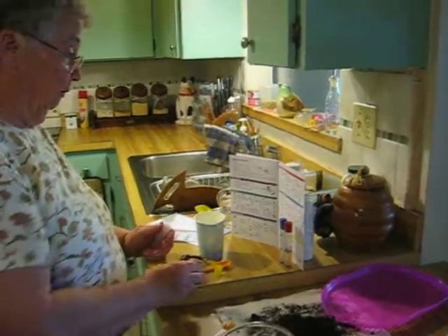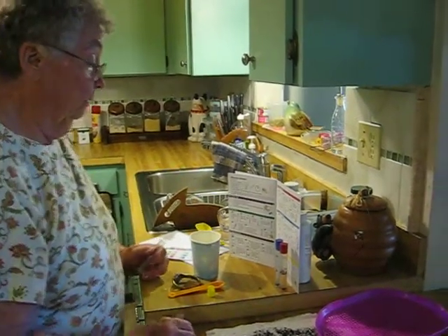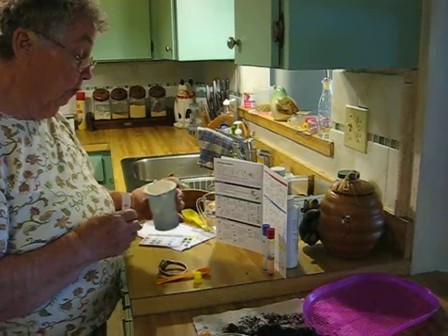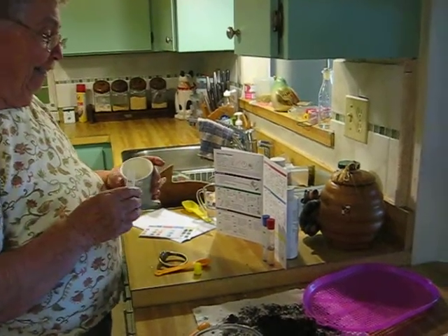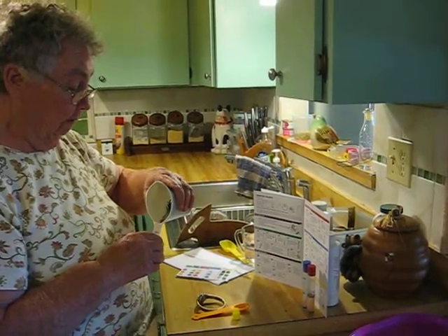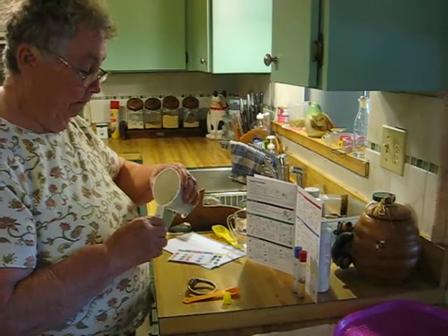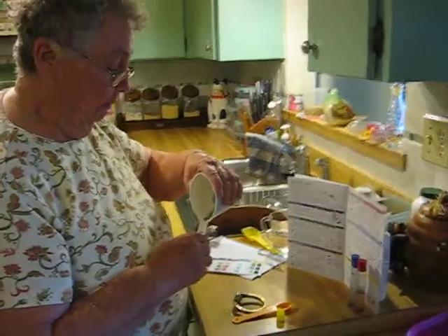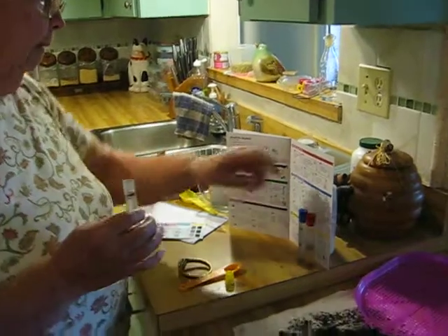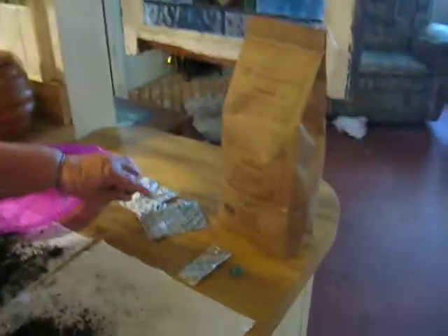So now this is the last test that we have to do, and this one is for the potassium. It says fill to the top line again with the clear solution in the paper cup. It's not real clear because apparently there was some stuff that wanted to float. Now the next step is to add one potassium test tablet — that's that one right here.